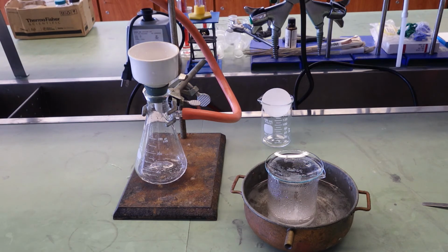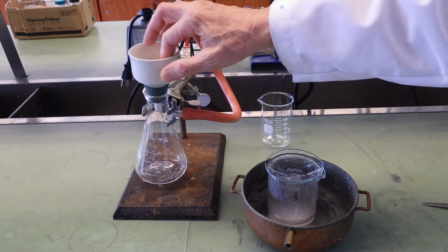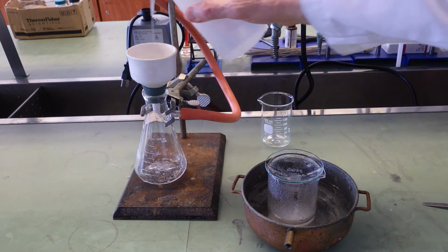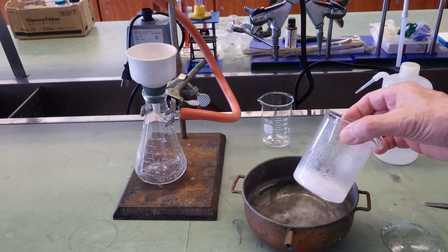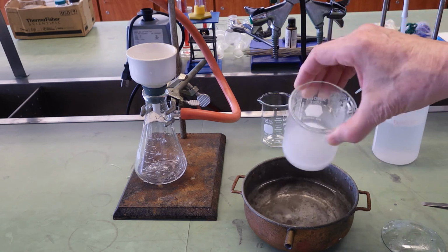Alright, so ready for the final filtration. Here's our pre-weighed filter paper. Seat that. Our solids have really congealed. I'm going to have to stir that up a bit with a stir rod before I can filter it.